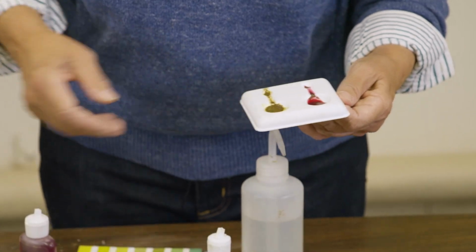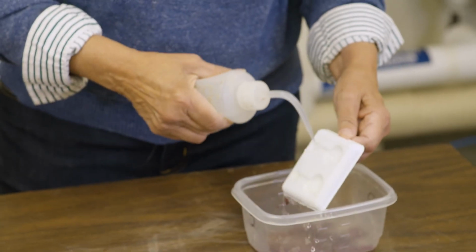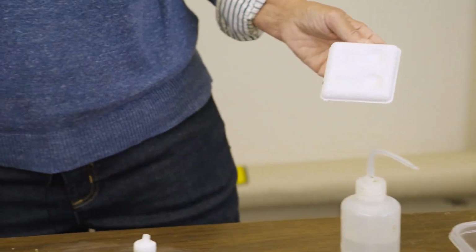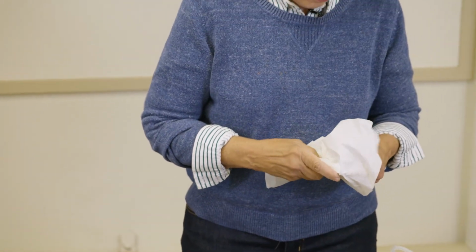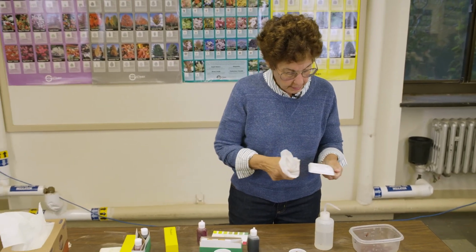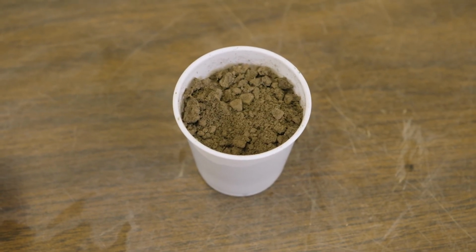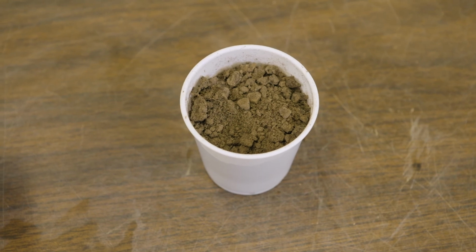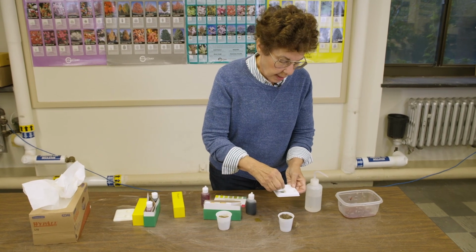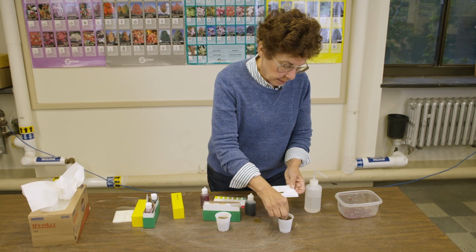Now when we're changing soils and we're going to do another soil or another sample, we always want to clean our plate with deionized water, so we're not going to use the pH of the tap water to change our reading. So I have another soil here, which we're going to test. You can't tell anything about the soil by looking at it in terms of what the pH is, and that determines very importantly how much certain elements are available to plant roots.